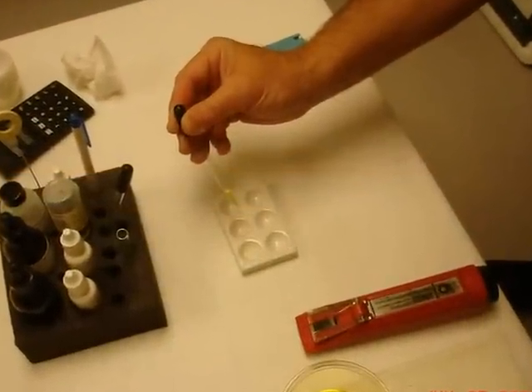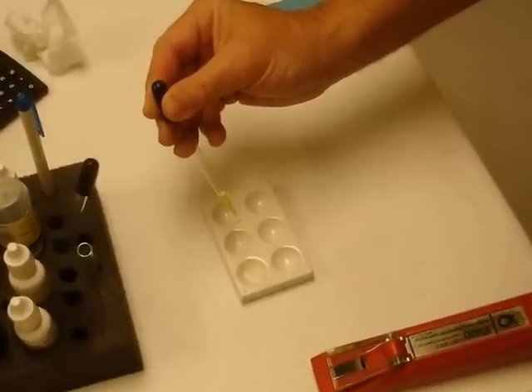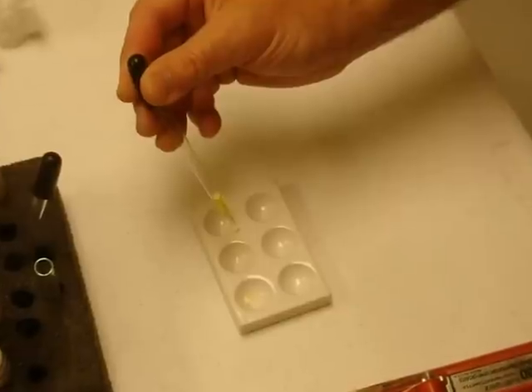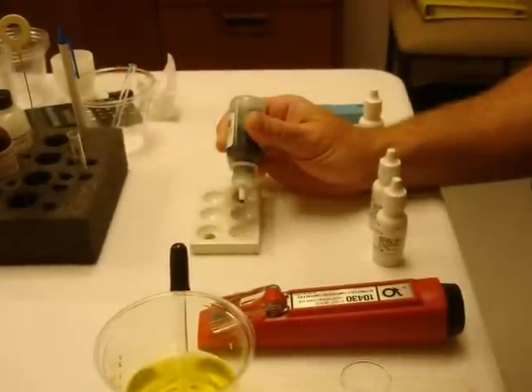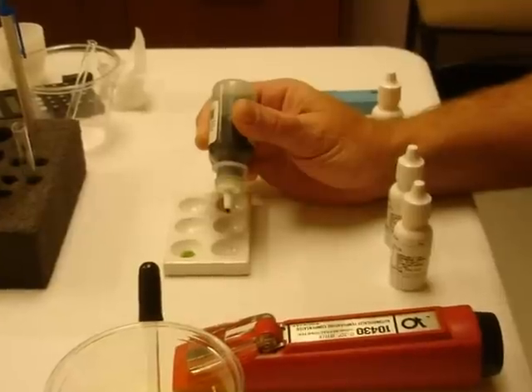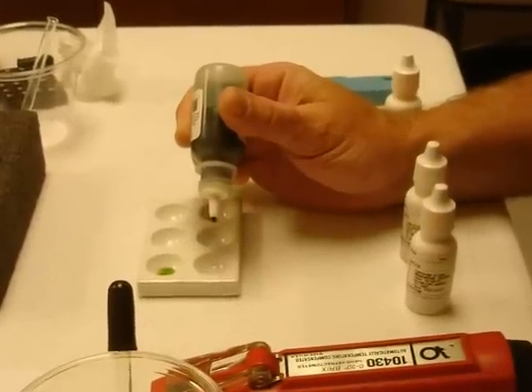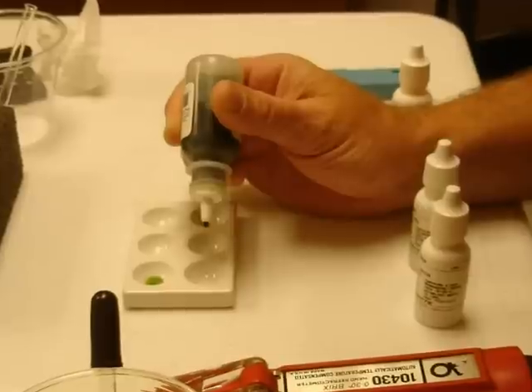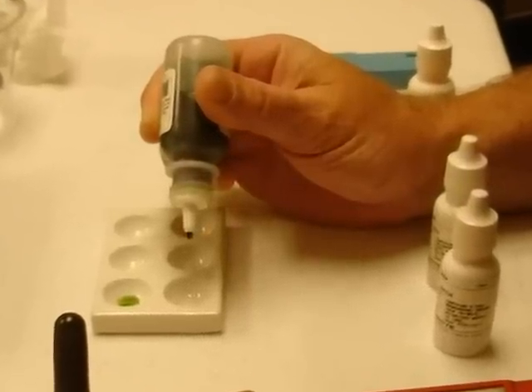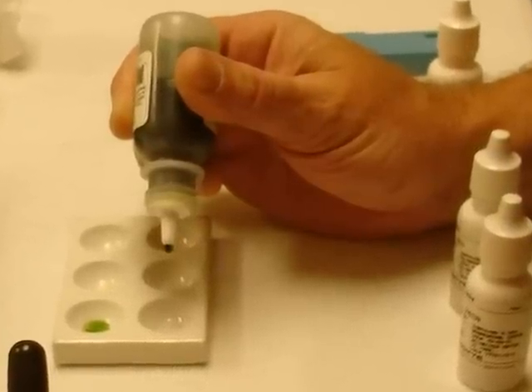If you choose to use the reagent system, you merely put a drop of saliva and a drop of urine in each of two depressions in a ceramic well plate. The reagent system calls for using a small drop of indicator solution in the urine sample and the saliva sample. Depending on what result you get, you may have to go to others in the indicator series to cover cases that are very alkaline or very acid.